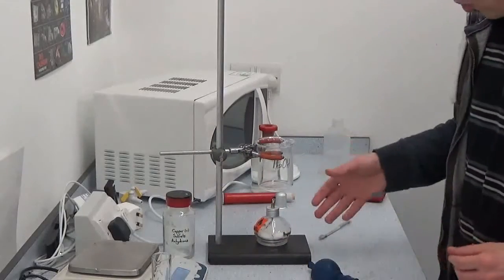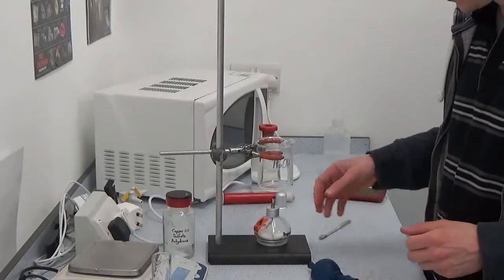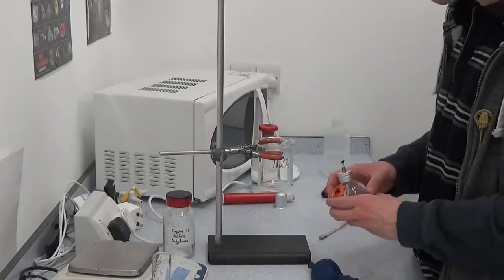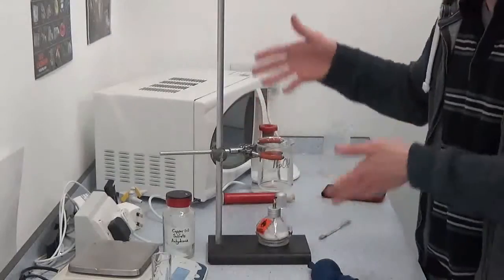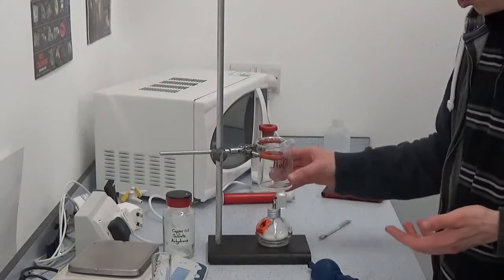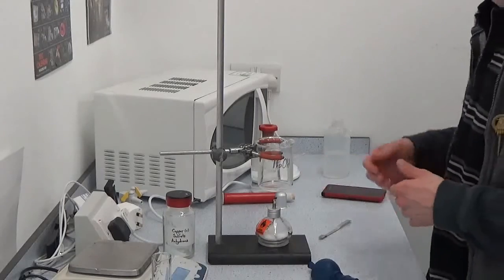Now what more typically appears in the exams are the enthalpies of combustion from burning the alcohols. So how you would do this? Set up your apparatus as you like, but as long as you've kind of got the alcohol under a beaker containing some water.